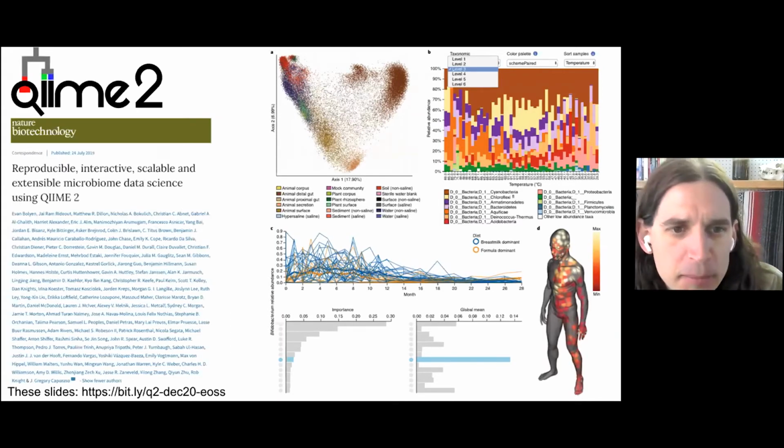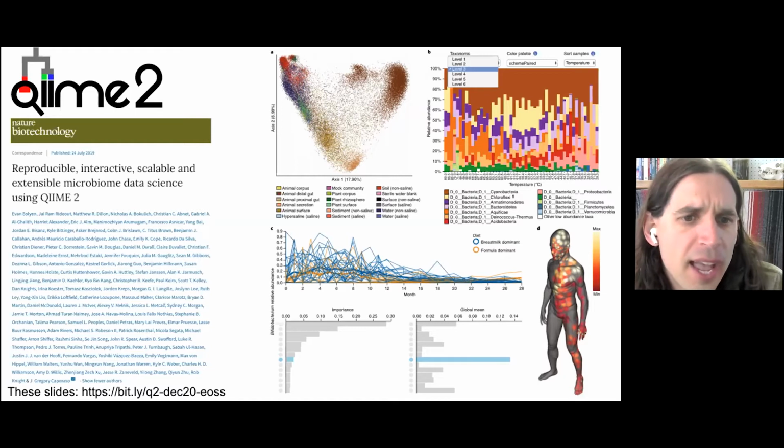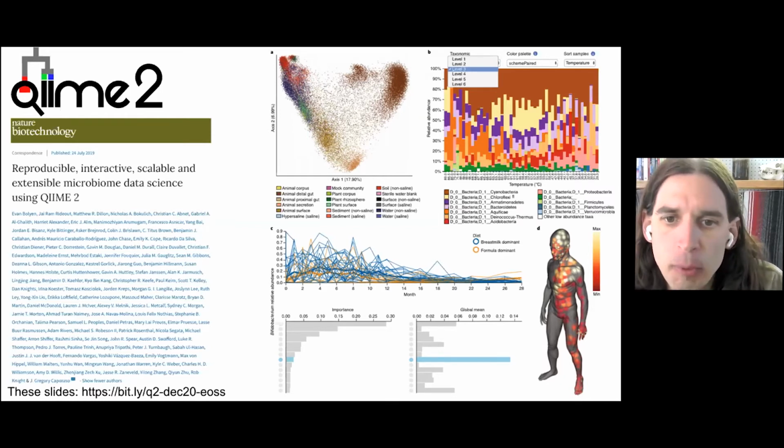And while my lab leads the QIIME development effort, it's really a huge global collaboration, and that's well illustrated by the author list on the primary QIIME paper, which we published a little over a year ago. There were 112 co-authors on this paper from 77 institutions in 10 different countries. And all of the folks on this author list contributed in some way to the design, the development, the documentation, or the support of QIIME.